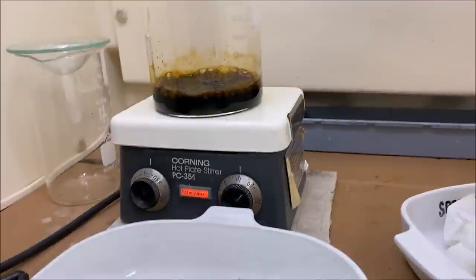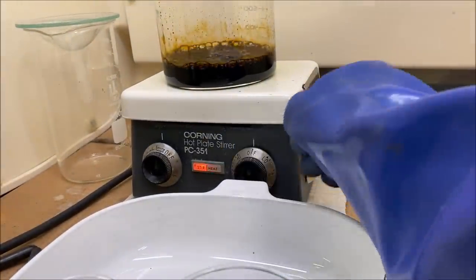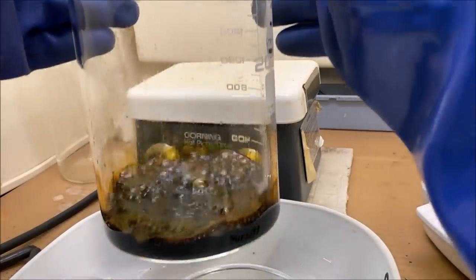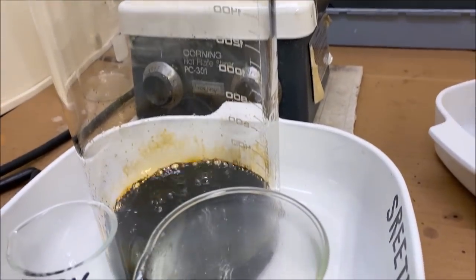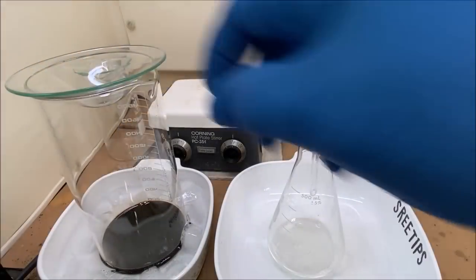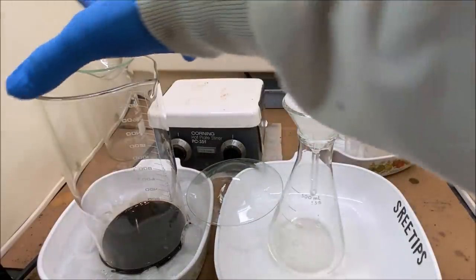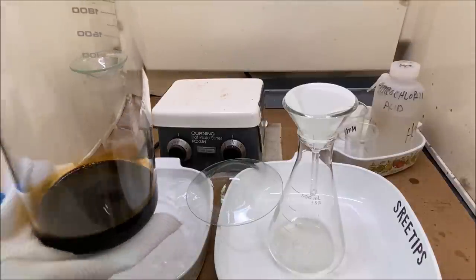And now what we'll do is we're going to reach in here, turn everything off. And thankfully, I'm done with the dissolve phase, hopefully. And we're going to pull this down off the heat and just let it cool off now. Here we go. We're going to try to filter our solution off here now. I've got it in an ice bath to cool it off.